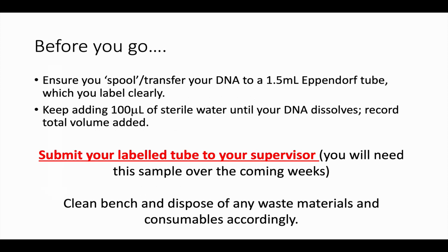So before you go, when you've transferred it into an Eppendorf, please label that accordingly and keep adding water until your DNA dissolves, recording how much you've added. And please submit your tube to your supervisor before you leave, because you need this sample in future weeks. And then clean your bench, and dispose of any materials and consumables accordingly.